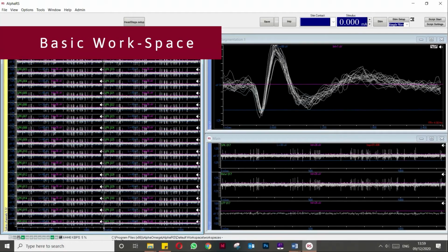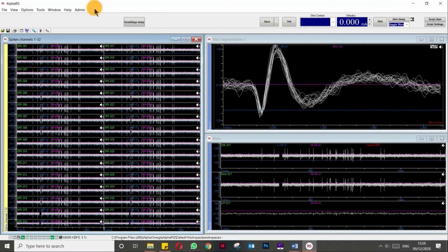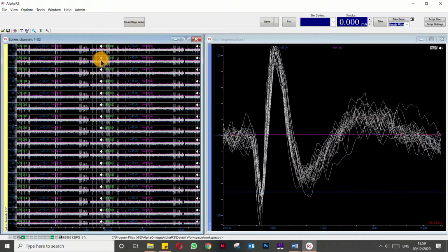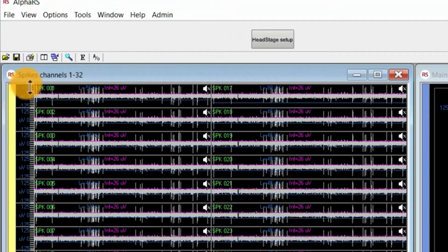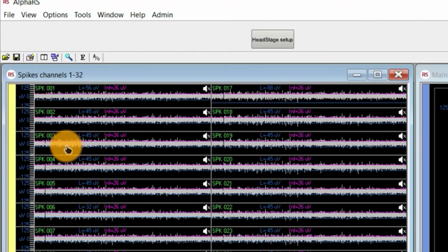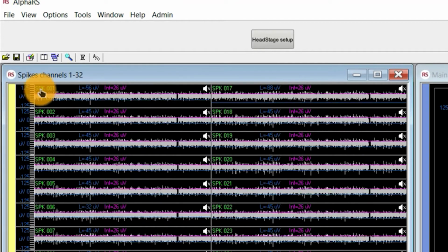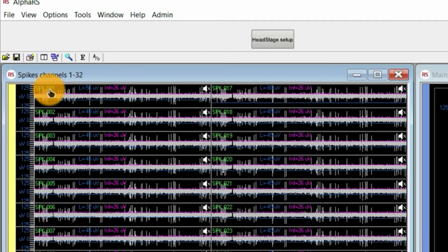Now I will be explaining more about the windows in detail. Looking at the SPK window and the main segmentation window, each box or adapter has a channel. For example, the following box has SPK1, which is channel 1, and so on. We have channel 2, channel 3. If we look at one box over here, we see on the top left corner the channel ID. For example, here it's SPK1 and it's shown in green.